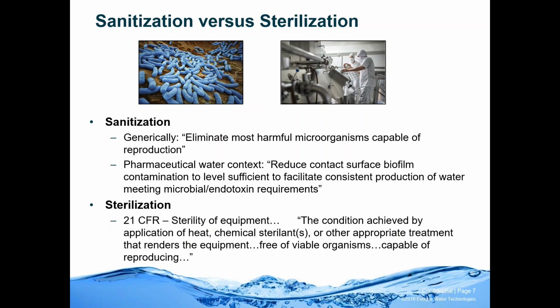To be sterile water from a USP standpoint, from an FDA standpoint, it would have to be packaged, terminally sterilized in a validated procedure with very specific sterility tests. So the aim here is going to be to get rid of most organisms and keep a water system in control.